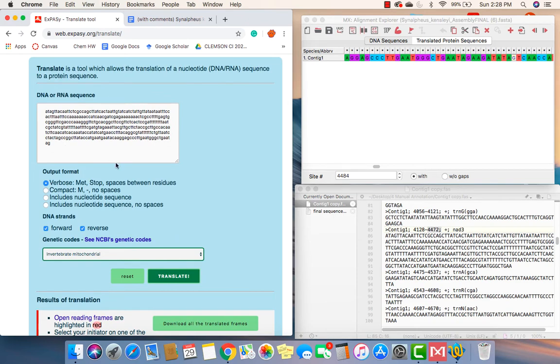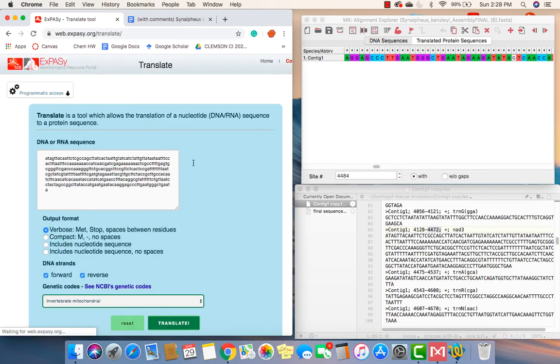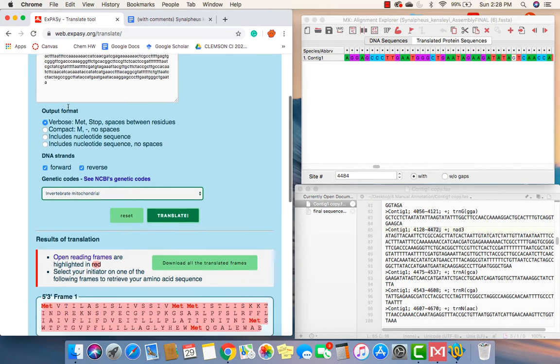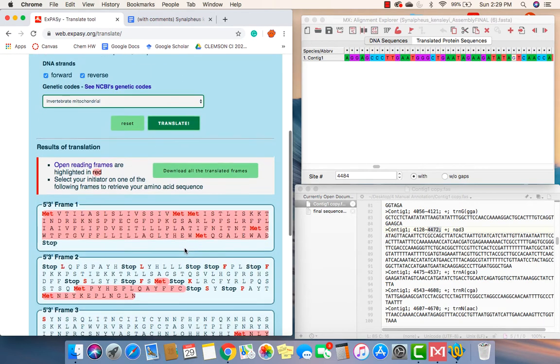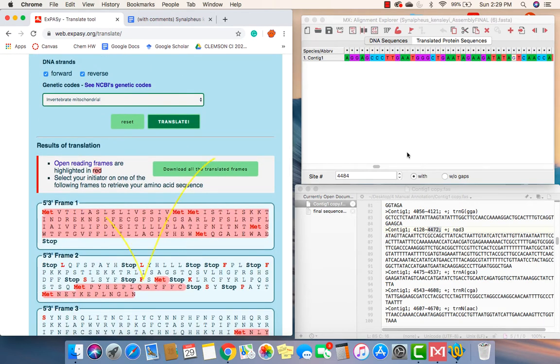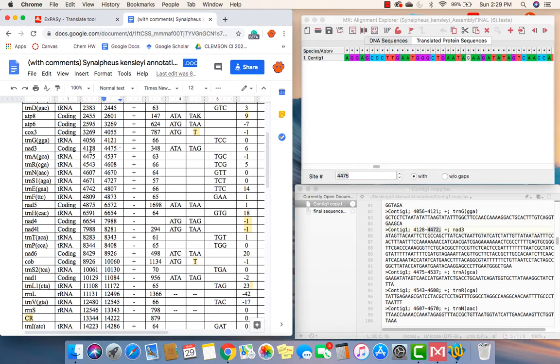Once I have found what seems to be the correct and complete sequence, I like to double check by removing the last couple nucleotides in order to ensure I have found the correct full codon. Now you can compare your sequence to the Mega file to find the numbered location of your stop codon. These can then be put into your table of your final annotations.